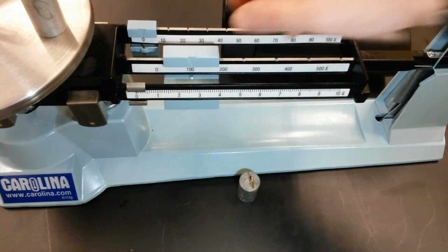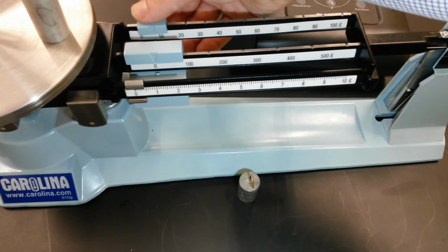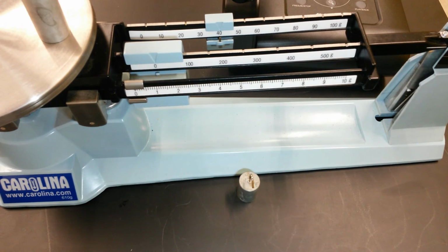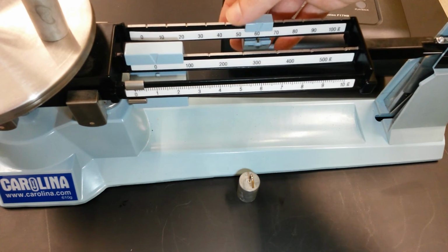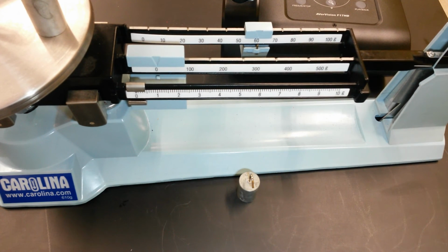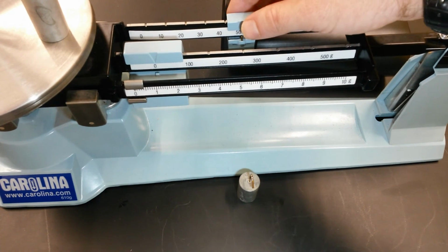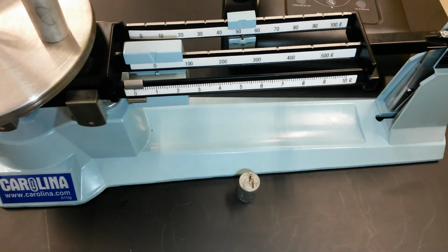So I'm going to move this over to 100. Since it tilted down, I know that my object is less than 100 grams. Now I go to my tens, and I can see 40 still hasn't tilted it down. I'm going to slide it out to 50, still didn't move it down, but 60 tipped the balance down. So now I know my object must be somewhere between 50 and 60. So now I would go back to 50, and I would start sliding out my ones. Now, I'm not going to complete the measurement for you because that's your job in tomorrow's lab, but I want you to know how the triple beam balance works.